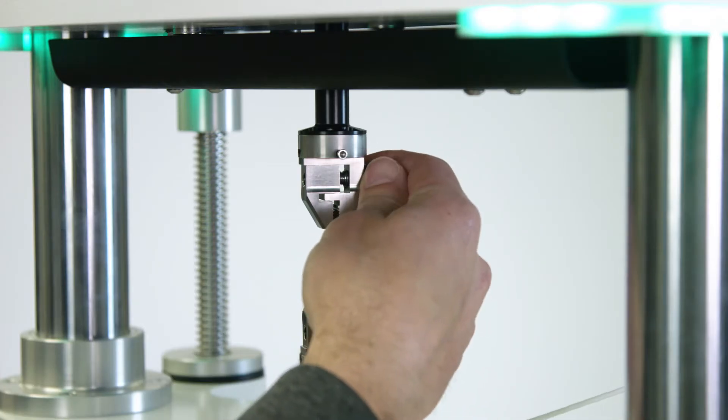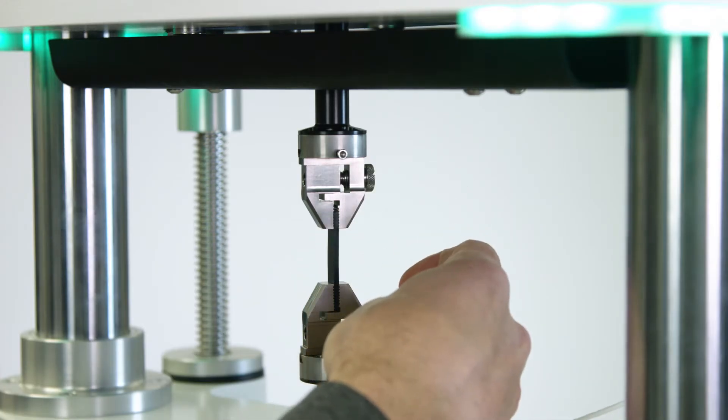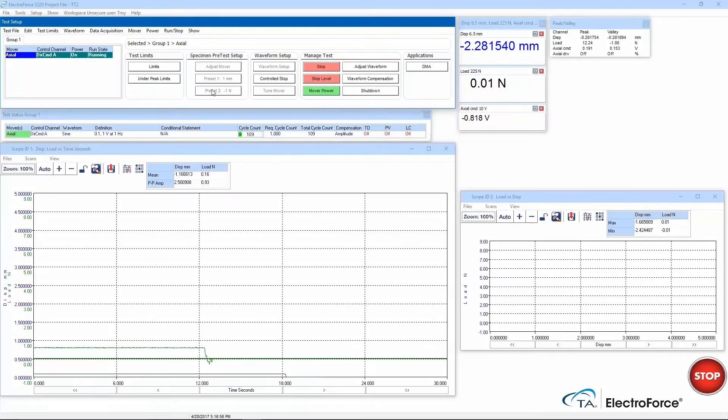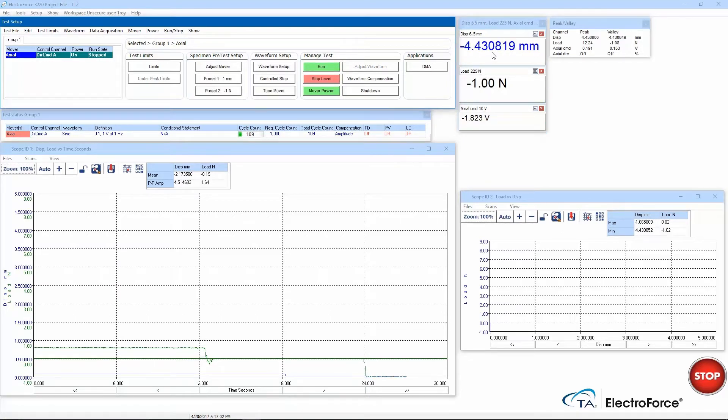For samples used in linear tension or linear compression tests, we can use the corrected sample height feature. To properly use this feature, I must configure the displacement channel in WinTest after my grips are installed and the crosshead is positioned and locked.